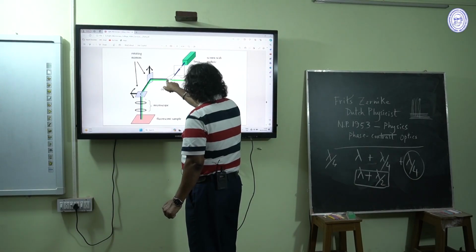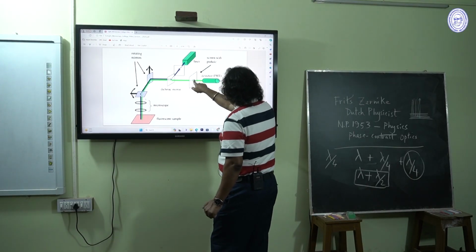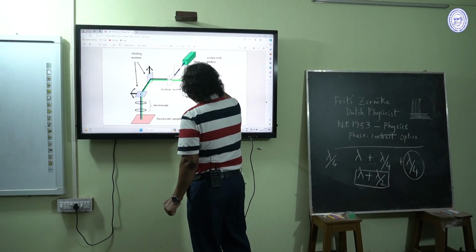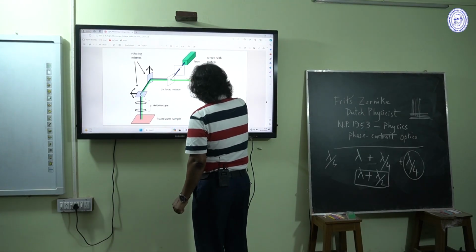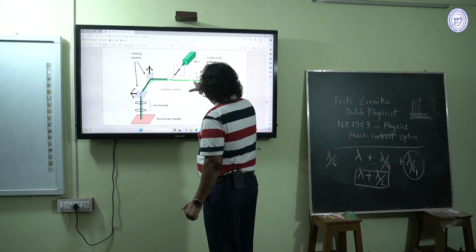Then after striking the dichroic mirror, it will pass through the screen with pinhole. Other images whose conjugate focal plane is not onto the pinhole will be discarded.